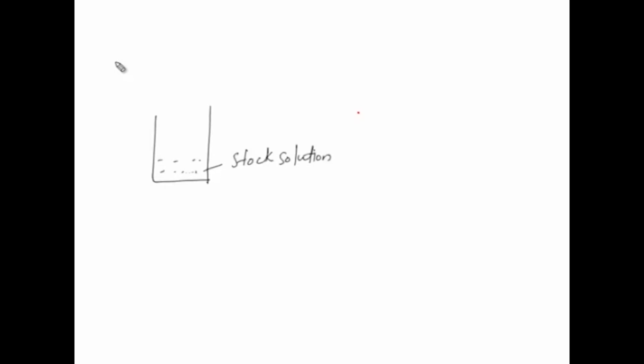Besides the stock solution of acrylamide, there will be buffers, which could be running buffer like electrode buffer and could be gel buffers where you have to make the gel, and these buffers we will be discussing later on. There could be a condition like a stacking gel and resolving gel, or it will be a continuous system where a single gel is utilized.